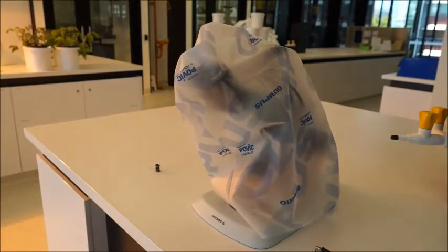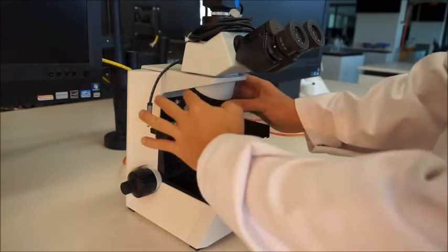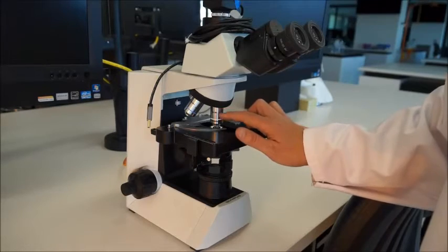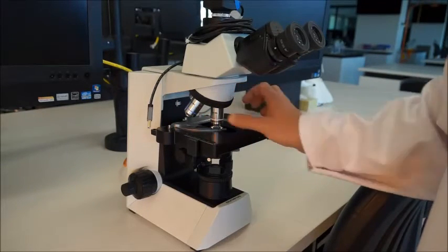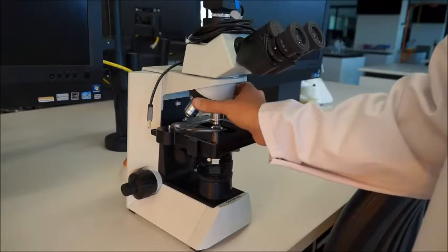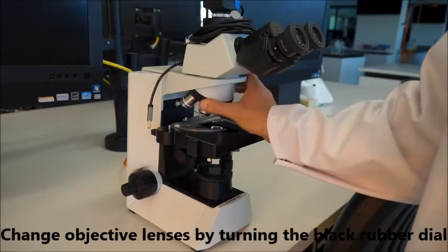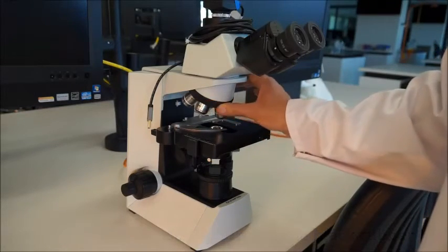There are a couple of additional things to worry about with the compound scope. There are four objective lenses here — you can see they're poking down these silver tubes. Avoid pulling them around by the lenses. There's a black dial here; it's much better for the microscope and it'll last a lot longer if you turn it using this big rubber dial.